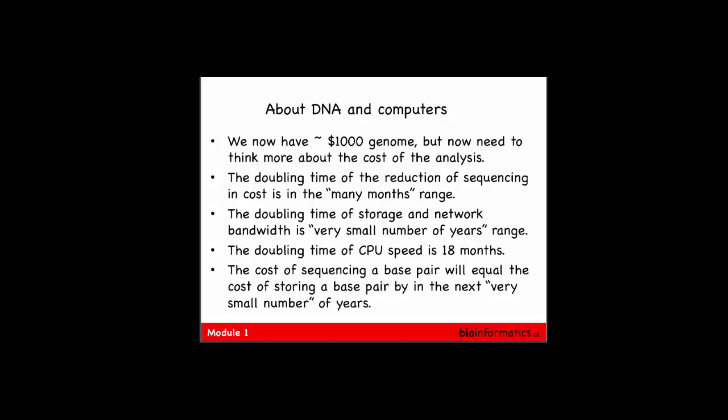And one of the reasons we have to keep all these FASTQ files around right now is that we actually don't trust any of our software to generate the right answer. So we want to keep the FASTQ, the raw data, around, so that when new software comes around it can reanalyze, remap and realign the whole thing, because nobody's got it right yet. That's why, if you read bioinformatics and computational biology journals, you'll find many, many new tools to align and map, be it for DNA or RNA. Like there are 100+ RNA-seq aligners.